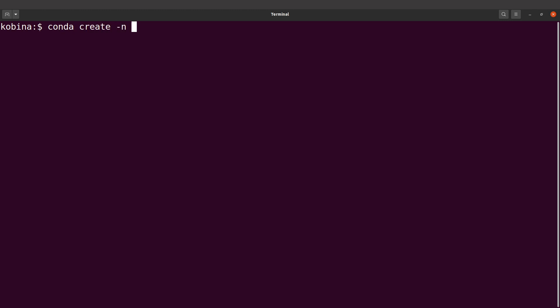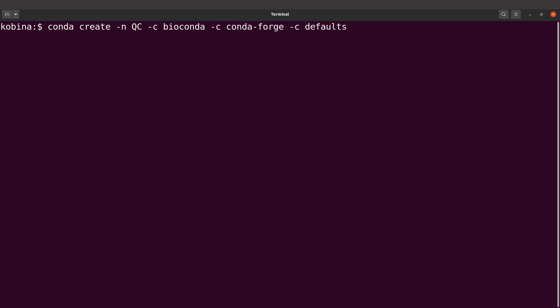So I'm going to say conda create -n and I'll indicate the environment's name, so I'll use QC. Then I also specify the channel, so I'll say -c bioconda. You can also add -c conda-forge and -c defaults. This is how we are going to specify the tool, in this case Cutadapt, and we are going to execute this command.